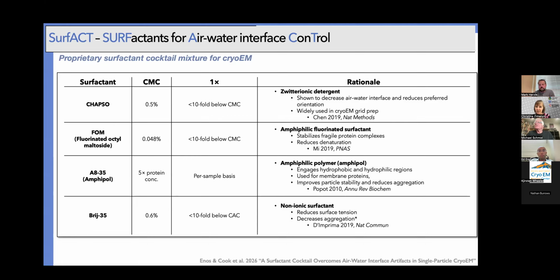Okay, another question. Are you going to come up with commercial screens available, like the X-ray crystallography screening mixtures? Great question. That's a work in progress. I'm waiting on tech transfer at UCSD, but I have been approached by several vendors to market this. And what we're thinking is that we're going to market basically a combination of six, where we have either dropouts or different working concentrations of components.